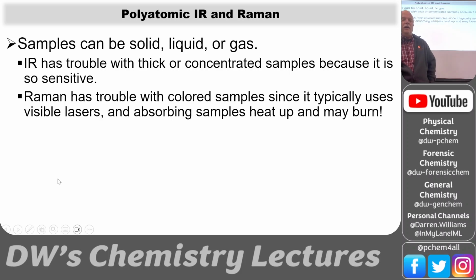Okay. Raman has trouble with colored samples because it uses visible lasers, and so a colored substance absorbs visible light. So if you send a green laser into something that absorbs the green, all that visible intensity is going to go into the molecule and catch on fire. So Raman with a laser a lot of times will catch your sample on fire. So you got to be careful with that, and it's especially dangerous.